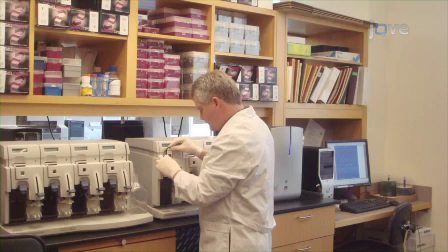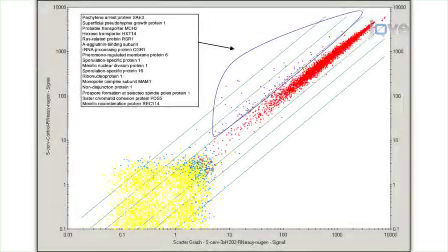The final synthesis product is hybridized to the Affymetrix yeast gene chips, and representative results from the microarray analysis are shown here. This first figure is an example of a scanned Affymetrix yeast gene chip image generated by the Affymetrix gene chip operating software. This is a 2D scatter plot of all genetic transcripts, about 6,700 genes, comparing control and treated yeast data. Each point represents a single gene.